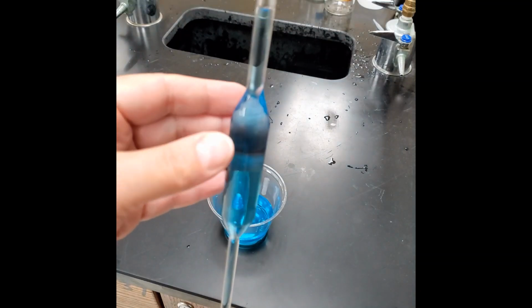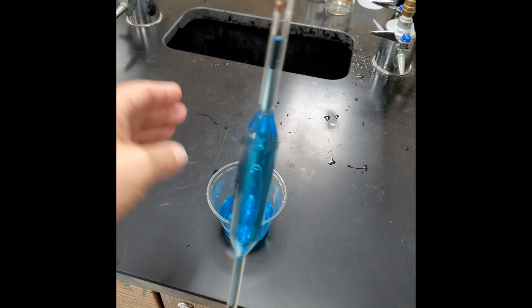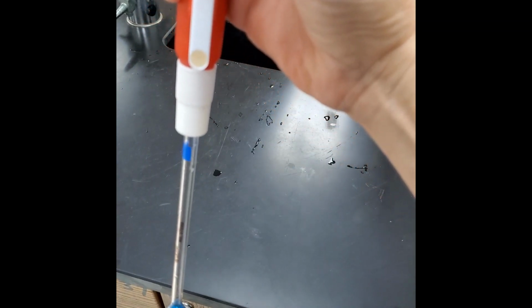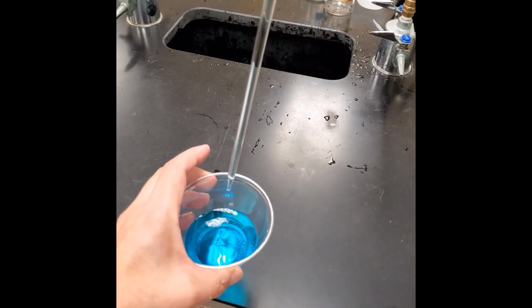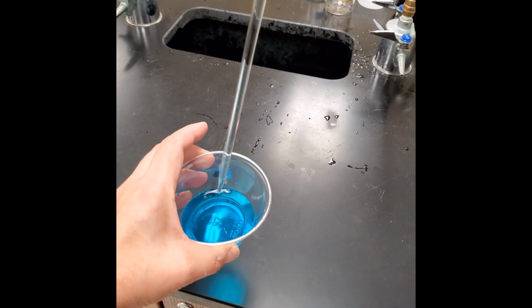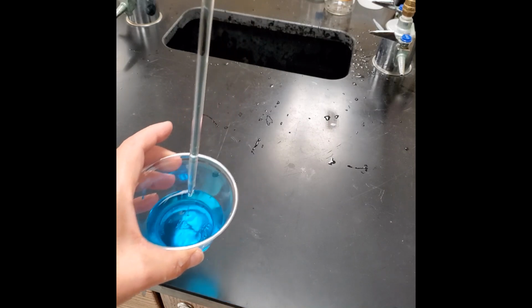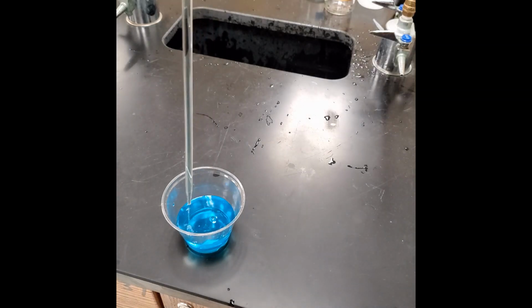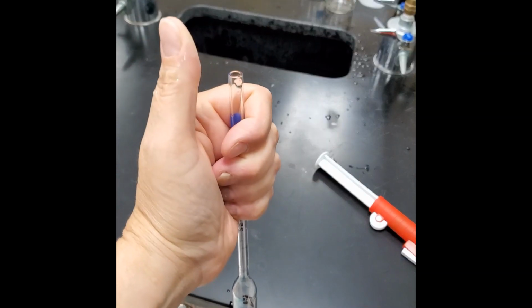So if you have a good seal, you can adjust this with the dial, and then when it comes time to empty, you don't have to take the filler off. All you have to do is push this in, which puts air into the pipette, which allows it to drain. So if you have a good seal on the filler and the pipette, you do not have to take the pipette off, and you can use the dial to dial in the correct volume. If you don't have a good seal, then you are going to have to take the filler off and use your thumb.